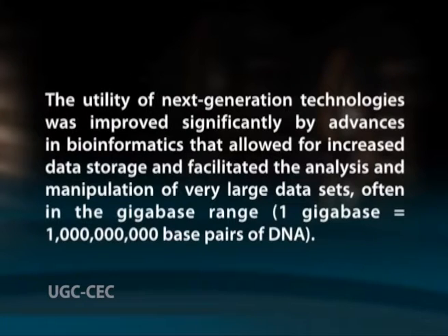The utility of next generation technologies was improved significantly by advances in bioinformatics that allowed for increased data storage and facilitated the analysis and manipulation of very large data sets, often in the gigabase range.